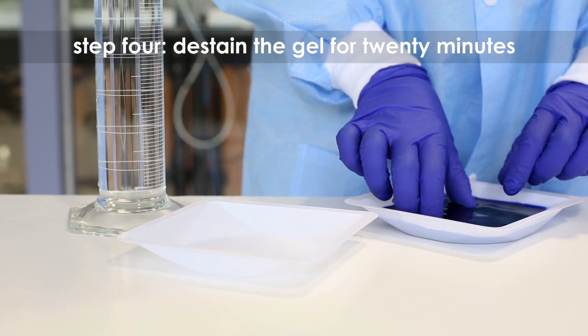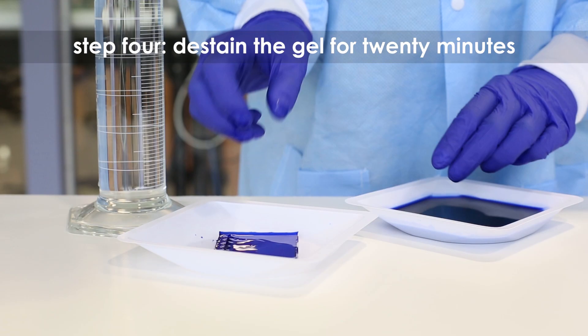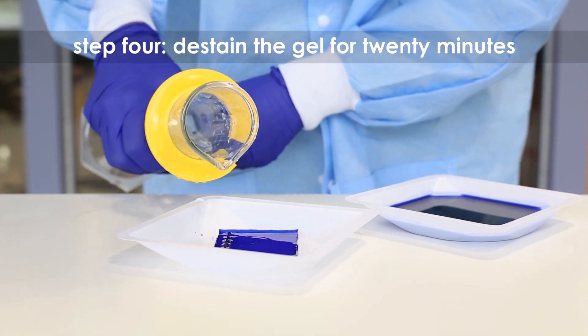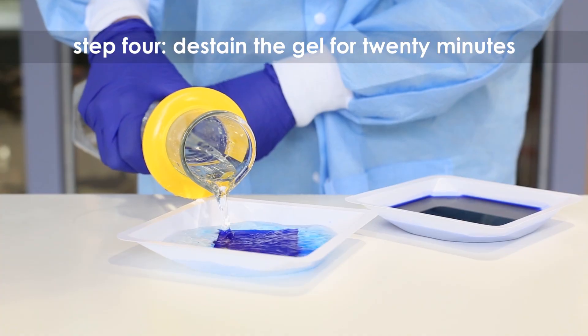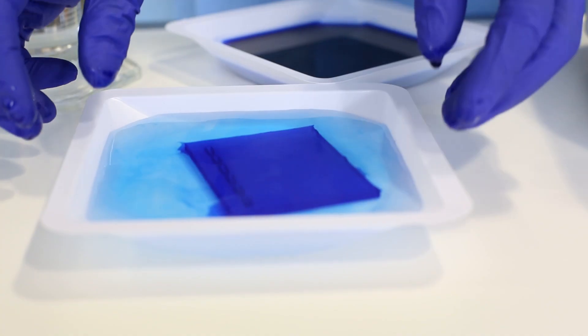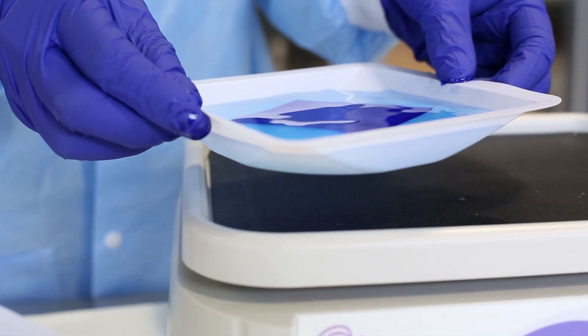Step 4. Transfer the gel to a second small tray. Fully submerge the gel in distilled or deionized water and destain for at least 20 minutes with gentle agitation. Frequent changes of the water will accelerate destaining. The gel may also destain overnight.